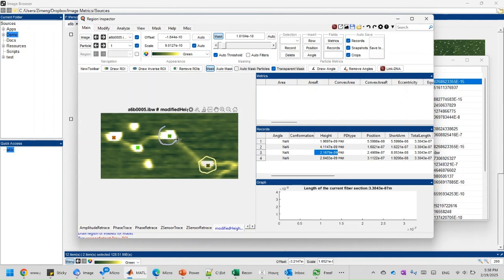Notice that the cross mark, the marker, is color labeled according to its sequence along the DNA trace. So you know exactly what's the first one, what is the second one. And it corresponds to the rows in this table. The first one, like this, would be the first row, and the second one would be the second row. So that's the correspondence.